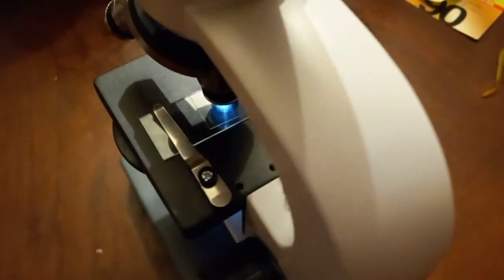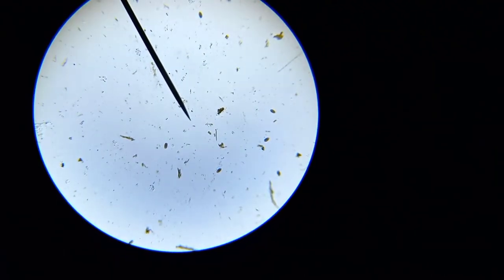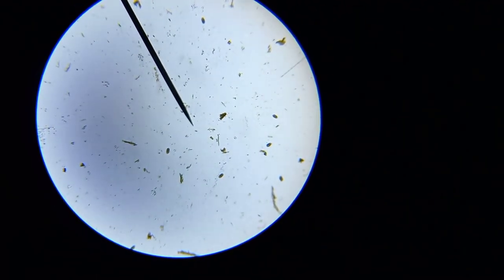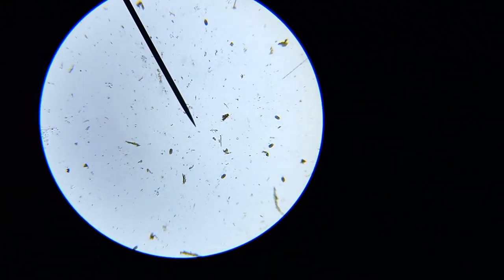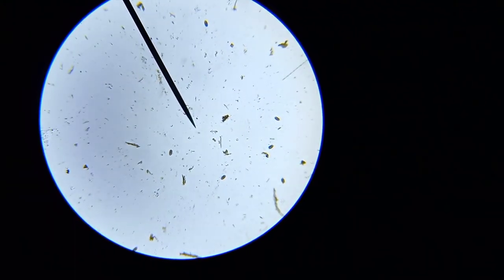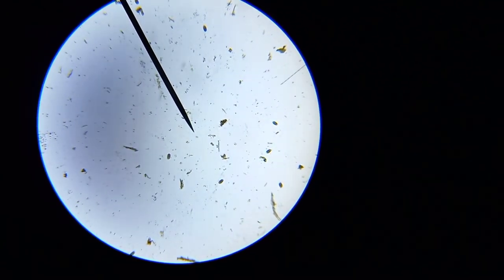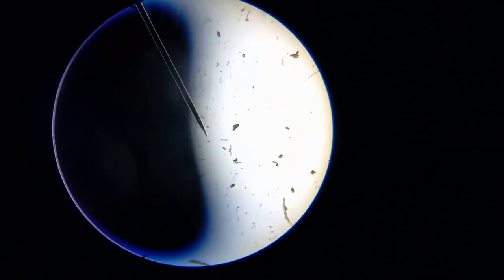Now we've got the slide on the microscope. This is at a very low magnification. You can see those little ovals all over the place — there are at least six of them in the shot. Those are the worm eggs. I'll zoom in on one for you.